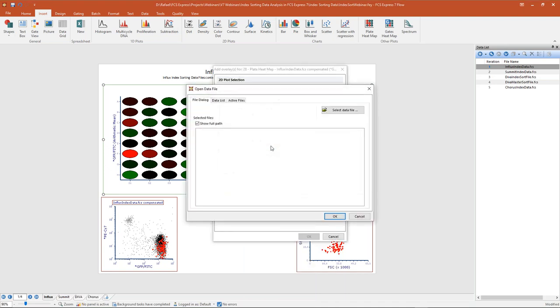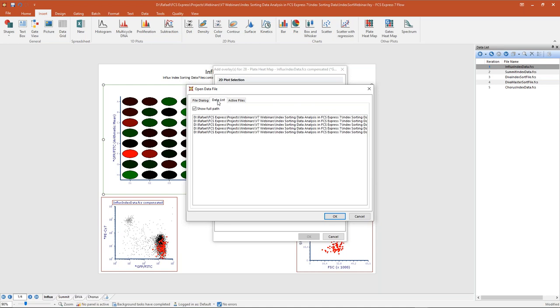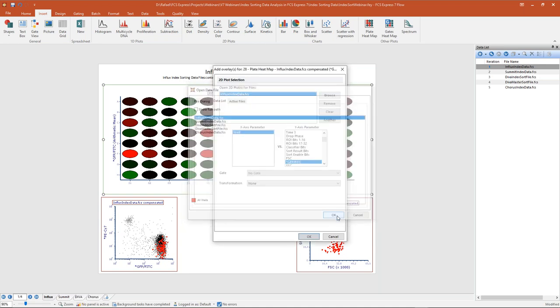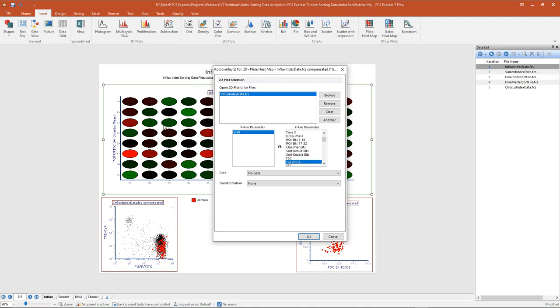For this Influx data, we're going to start by adding an overlay using the pie method. To add an overlay to our heat map, we right-click on the heat map and select 'add overlay using advanced open data dialog.' Because we're overlaying the same Influx file, I go to my data list tab, check the box to show just the file names, select my Influx data, and click OK to load that in as a second overlay.